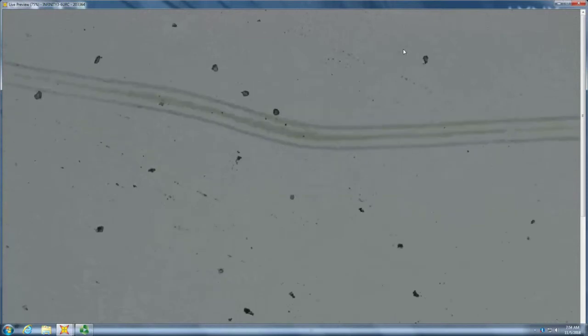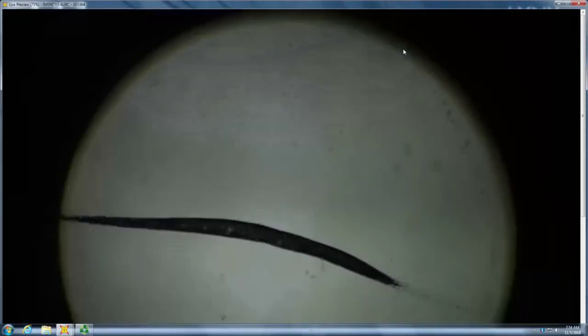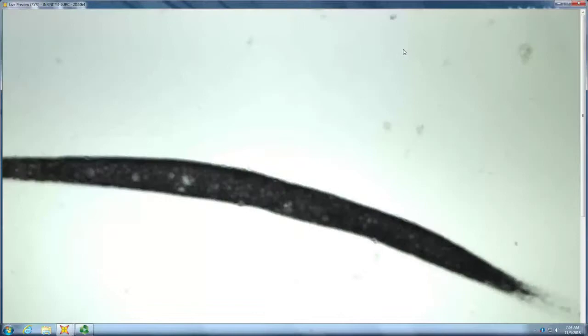Do our next one. And it's a hair shaft. This hair shaft seems without pigment. So it's a hair shaft without pigment. And another one. And then what happened? Bubble hair, which in the South we call bubba hair.